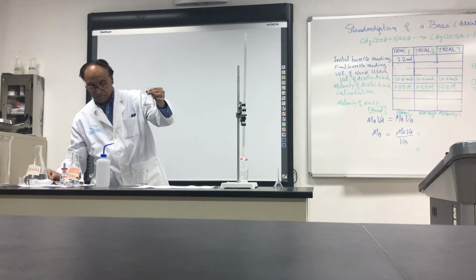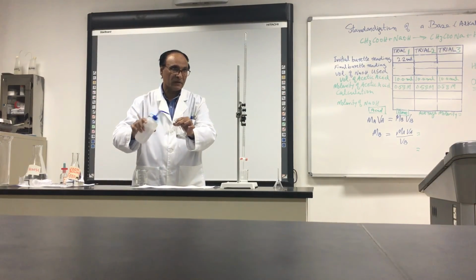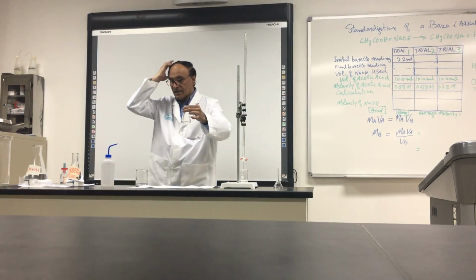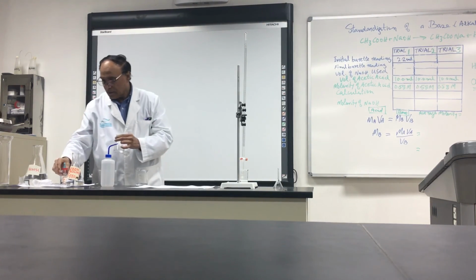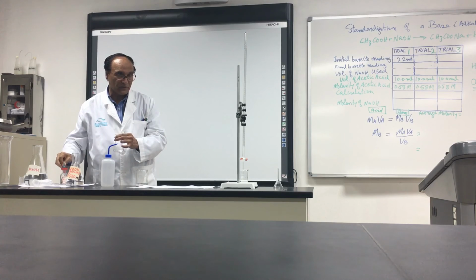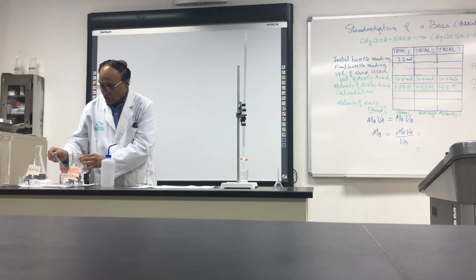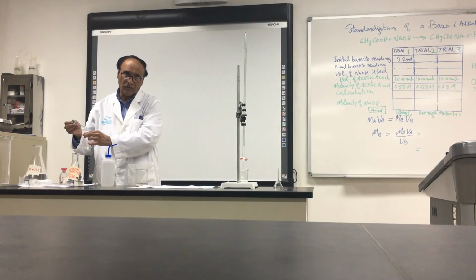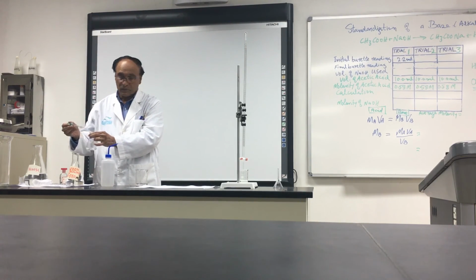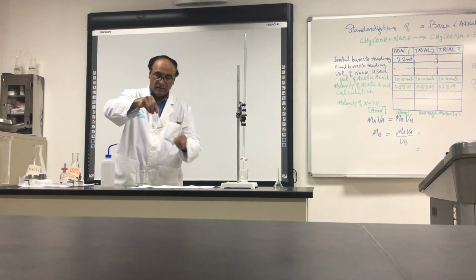If there is some water, water will make no problem because water is not going to react. It is the acid which is going to react with this one. Then you put 2 or 3 drops of the indicator. Don't forget. If you forget the indicator, there will be no end point. 1, 2 and 3. Even 4, 5, no problem. So 2 or 3 is okay. And shake it.